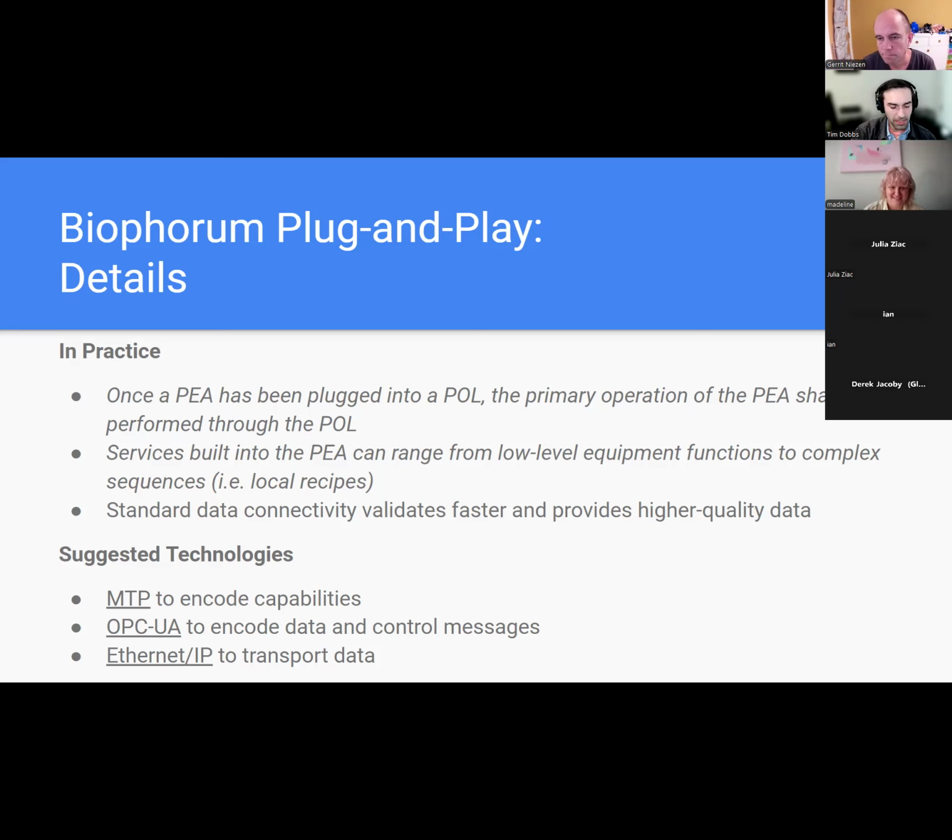So I buy it. And then finally, for the transport layer, they say EtherNet/IP. IP in this case is industrial protocol. So it's Ethernet plus an extra layer of robustness to support industrial processes. So yeah, that was interesting to me. OPC UA LADS? Oh, interesting. That actually comes up in the next paper, so we should talk about that.